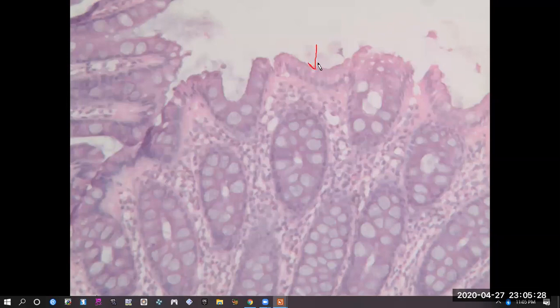And a closer look here on the colon. So we can see the simple columnar epithelium. And now that we're zoomed in close enough, we can see another distinguishing trait of the colon is just the abundance of these goblet cells. These are mucus-producing cells, and you notice they're right alongside the simple columnar epithelial tissue, and they're just in great abundance in the tunica mucosa of the colon.